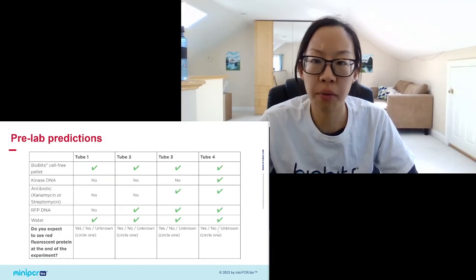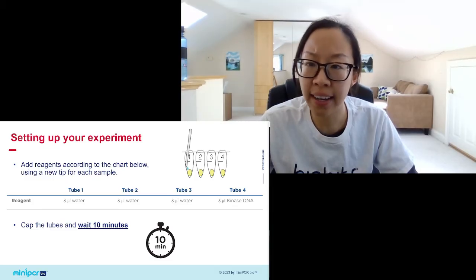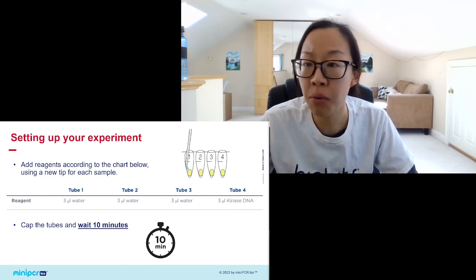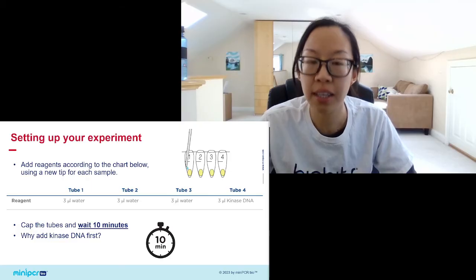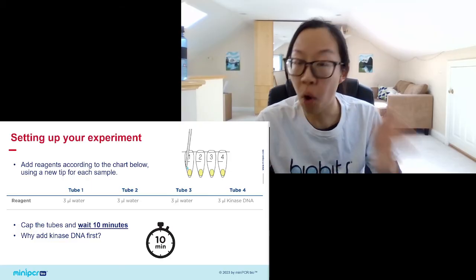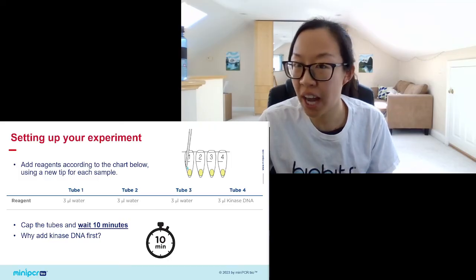All right, so if we get back to the tubes, again, this is a reminder of what I have already added. And just as a little pop quiz, does anyone know why we added the kinase DNA first, waited 10 minutes before I'm going to go on and add everything else? If you think you know, put it in the chat.